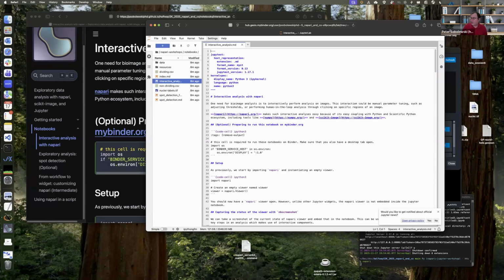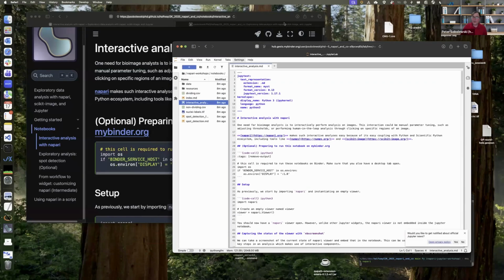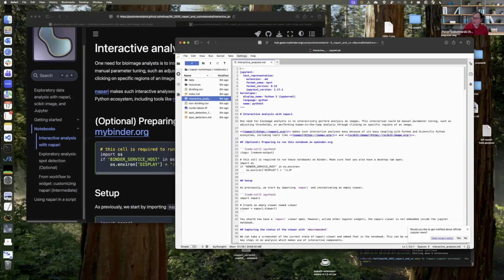So if you're having trouble with the installation, or you just want to give up on that, you can try using the cloud platform. Everything that we're going to be doing isn't going to be super resource intensive, and I've tested it in the cloud platform. It's not the best experience, but it's better than nothing. So that's an option.